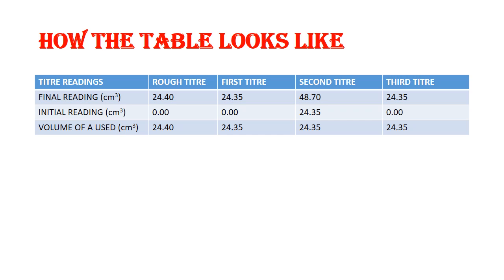Okay, so if it is 26 that you stop at for your initial and you want to continue from there, it means you don't refill the acid. You just replace the base and then you continue titrating from there. That means your initial reading will now be 26.00 centimeter cube. And if you continue titrating from there, you will find out that it will get to maybe 52 point something before the color will change.